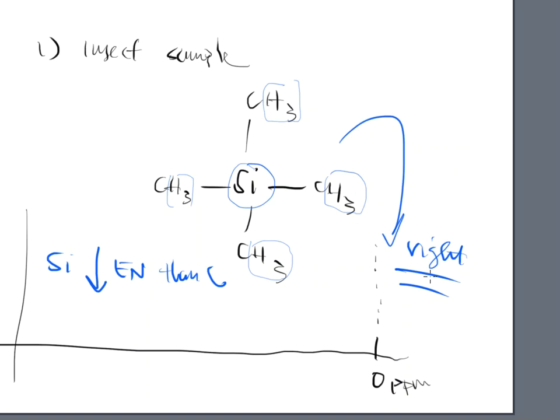All right. Not only that, but the signals are also very weak. So when we do get signals from the NMR, this is going to be so tiny. They're going to be present. I'm going to be able to see them, but they are so little that it's not going to distort the NMR in any certain way at all. And that's actually pretty good for us, right? We don't want something so tall that it just distorts the entire NMR, and I really don't see signal from the actual sample.